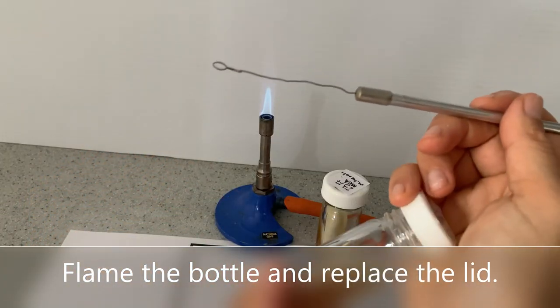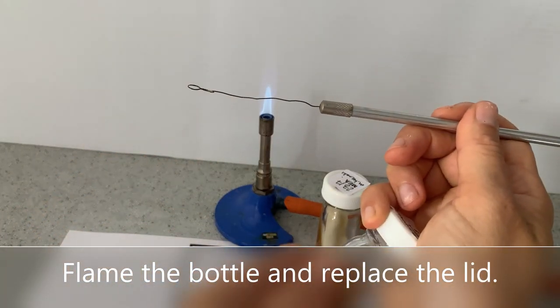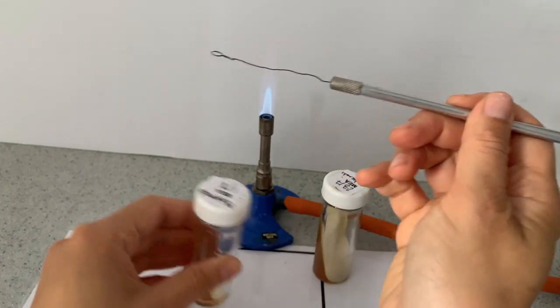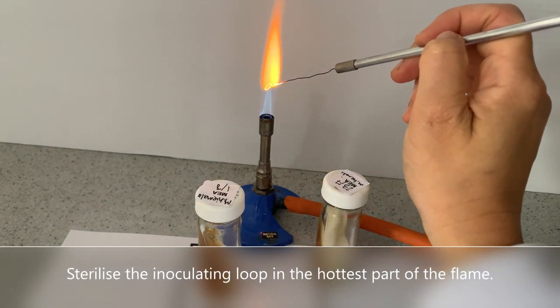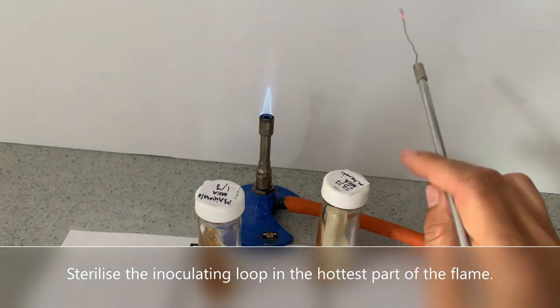Flame the bottle and replace the lid. Sterilise the inoculating loop in the hottest part of the flame.